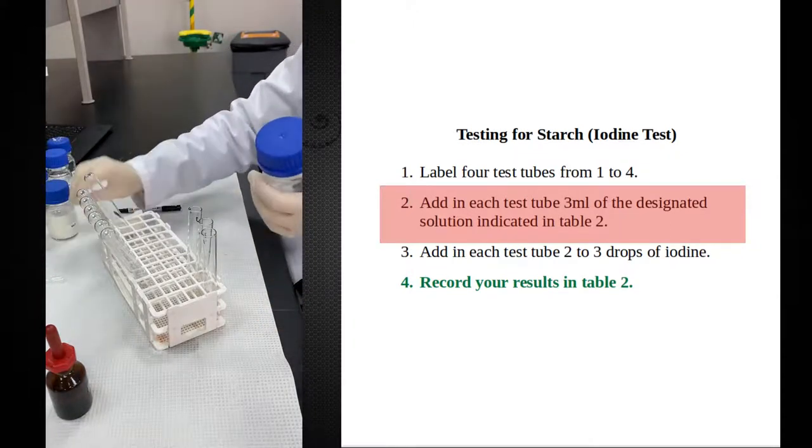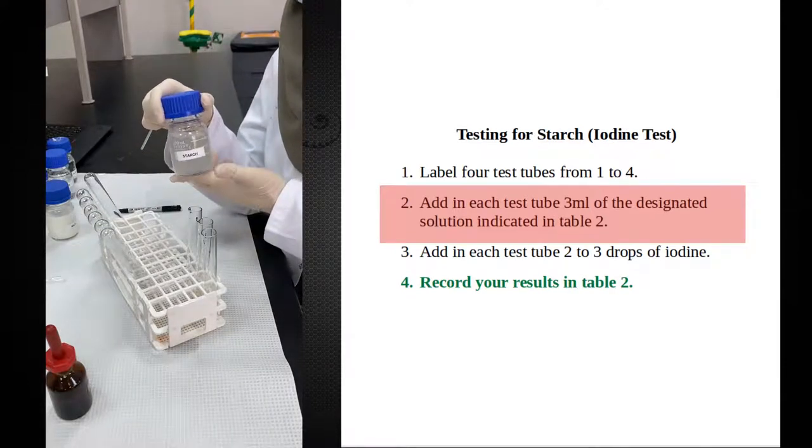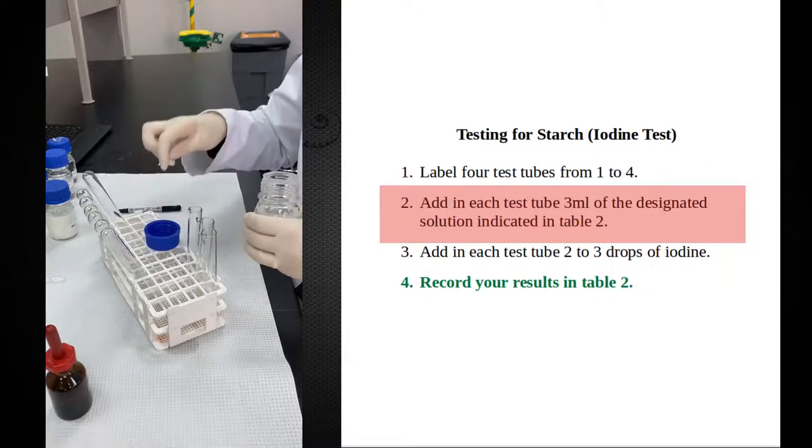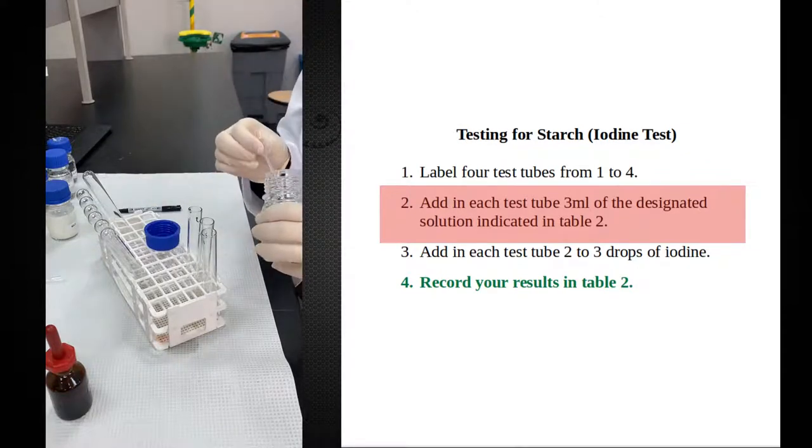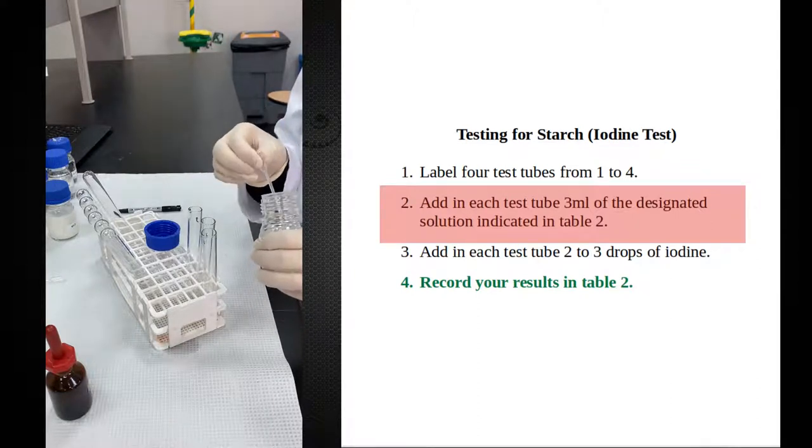In the next test tube, I will add, I need a positive control, and it's going to be a solution of starch. Starch solution is my positive control. So iodine is a test of starch, not for any polysaccharide. It's a test for starch.